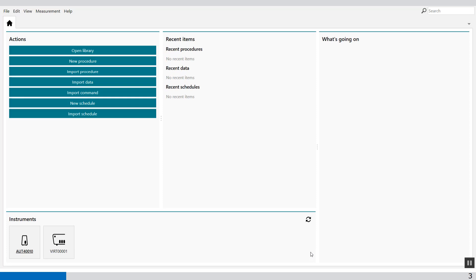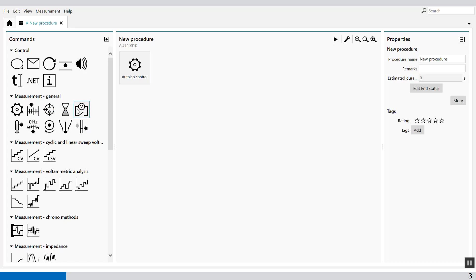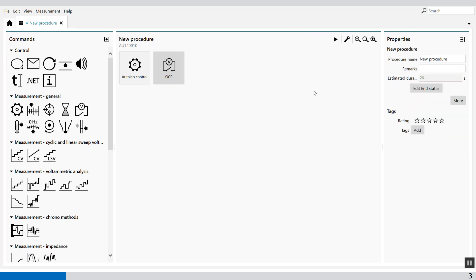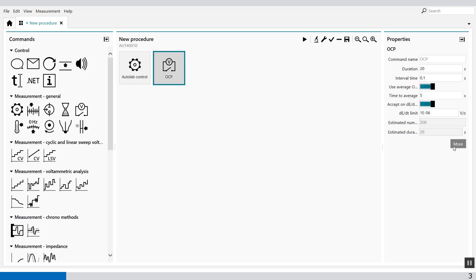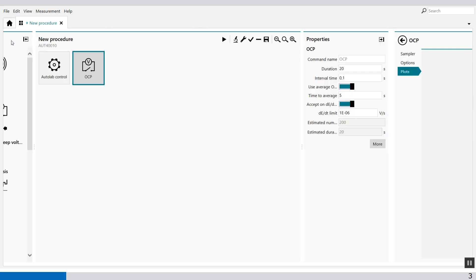First, we'll start with the Autolab control command. So we can say New Procedure, Autolab control. Then we select the OCP measurement and set it to 20 seconds — the default is 60 seconds, but we set it to 20 seconds. We also select the plots in plot number 5 and plot number 6.